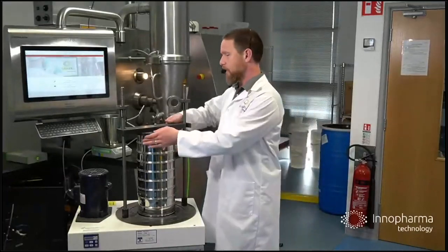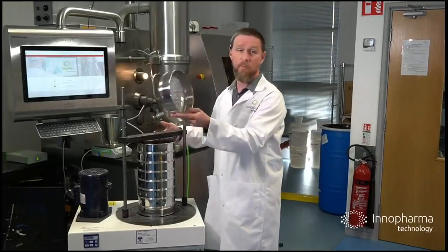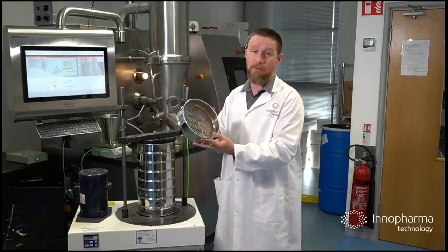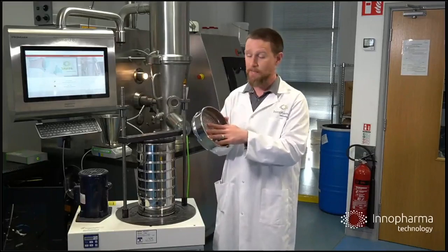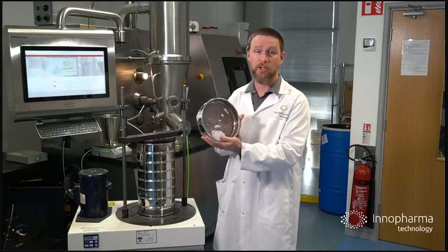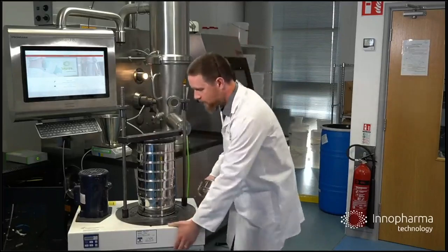All I really want to show here is that these sieves are just essentially made up of wire meshes. You can get them certified and regularly calibrated, but sieve analysis is a very robust method, very long-standing, but it's not without its drawbacks, as mentioned, mainly to do with orientation of particles potentially falling through on their shortest size, not on their correct size. Okay, so if I move this guy out of the way.